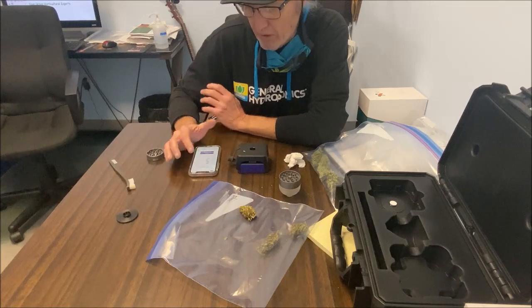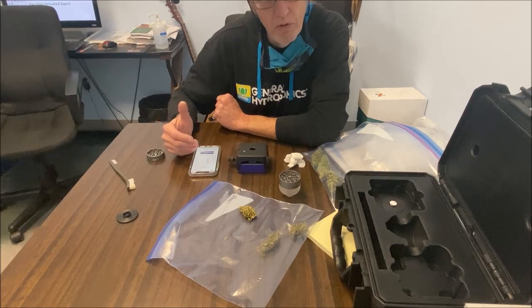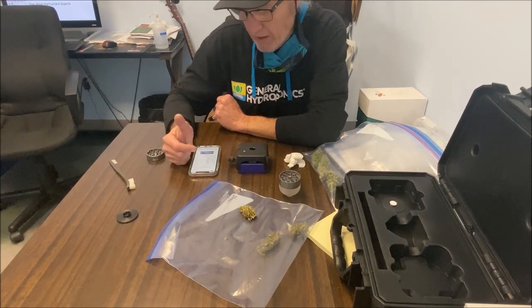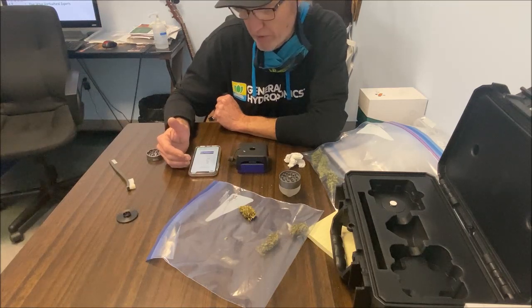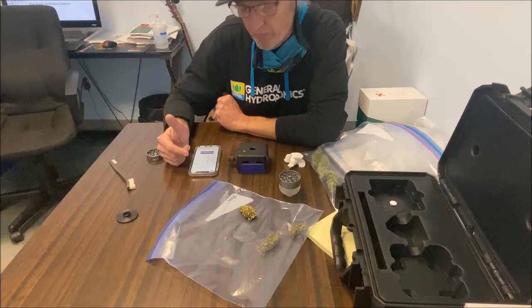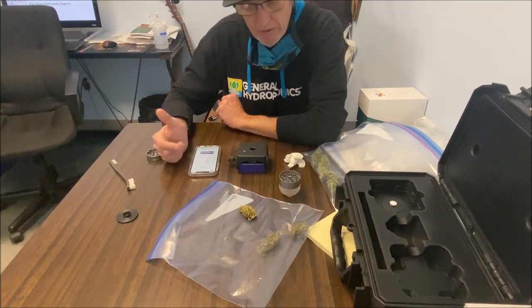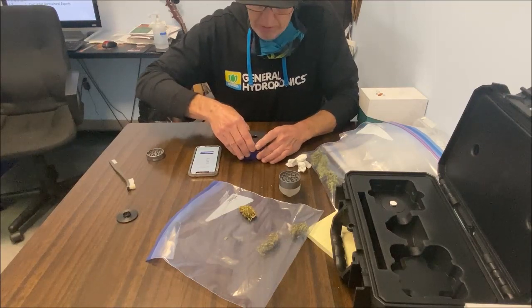So the wild card here, I think, is the terpene profile, and the terpene profile affects how you feel the THC. So I think it's probably just got a lot of enhancers in the terpene profile, makes that 6% feel like a lot higher. So I'm very happy with the result. Surprised, but happy. So let's move on now and do the Clean Chemo. Let's see what it came out to.